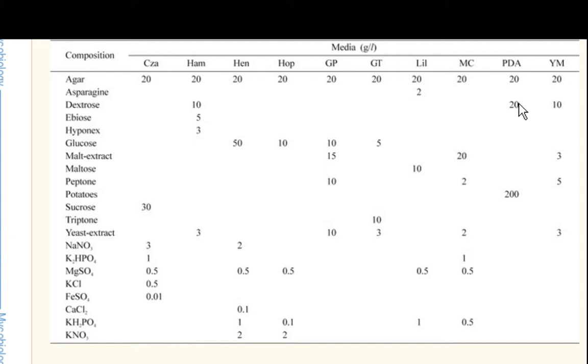I think that's better. That way the new strain is creating different enzymes in order to survive off the new types of sugars. And I was told they grow better if they have different types of nutrients that they can get their energy from. And the other is sucrose, which is just plain table sugar, and they're actually using that here.